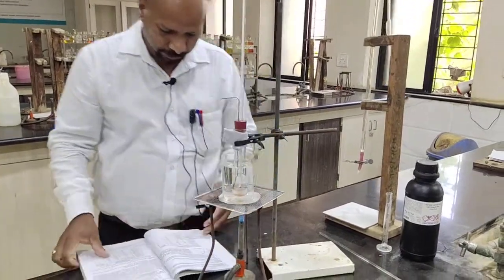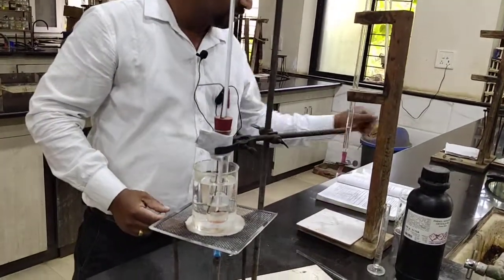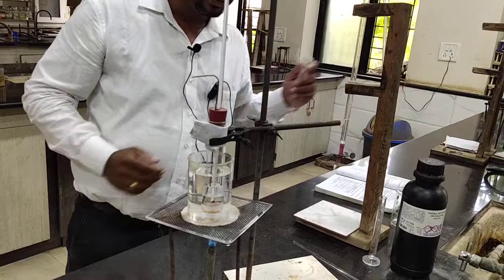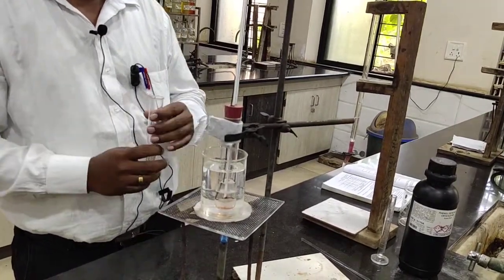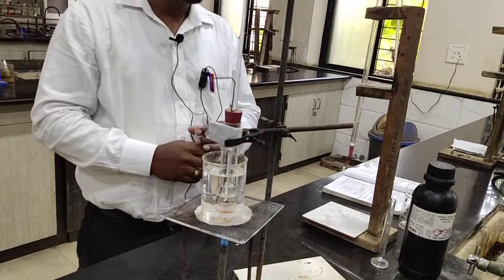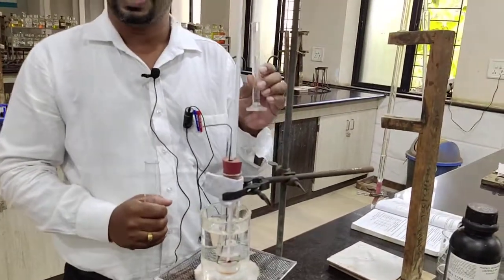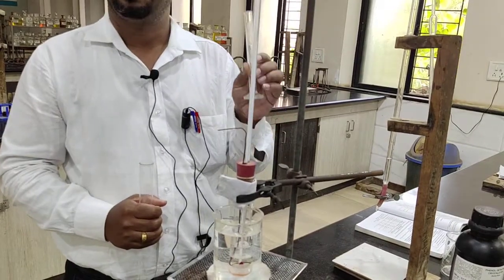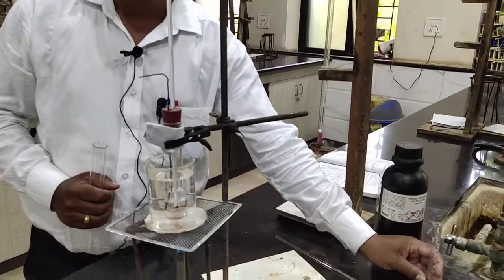Okay, now the experimental part. What we have to do: first take the hard glass tube, then measure 10 gram, so 10 gram means 9.5 ml of phenol, with the help of a cylinder.